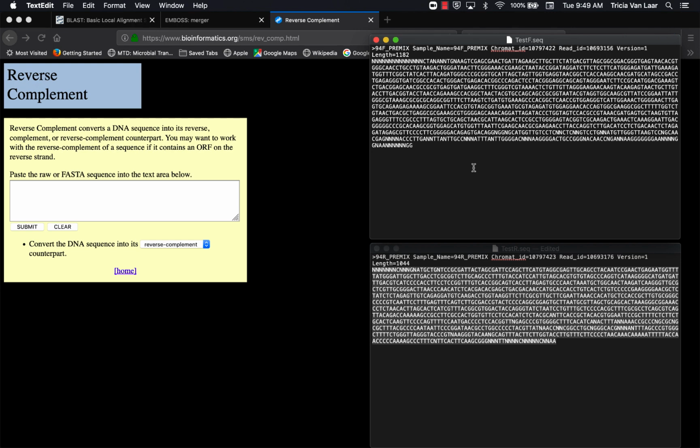What we do in this sequencing procedure is you guys PCR amplified your 16S rRNA gene, and you generated a fragment that was approximately 1,300 base pairs.